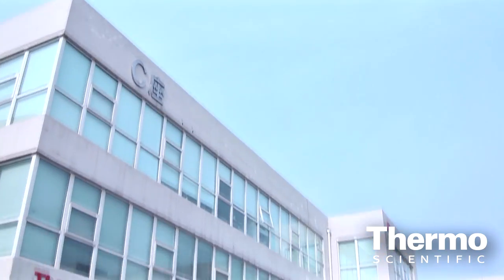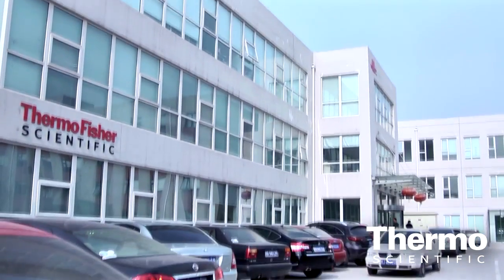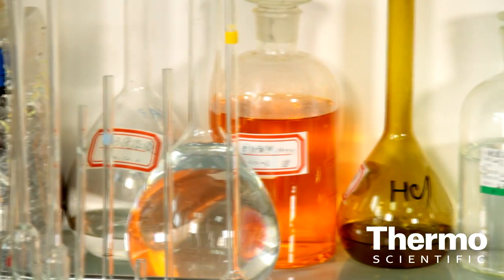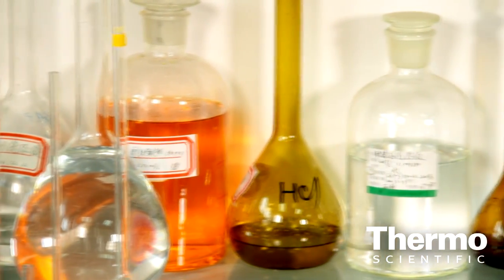Li Yang, tell us about the laboratory and the work that you do. Here is Zhongqing Environmental Laboratory Centre, part of the Environmental Protection Research Institute of Light Industry. The centre is a multi-functional lab. The main samples we undertake are waste water and waste gases, as well as regular heavy metal inspections of soil.